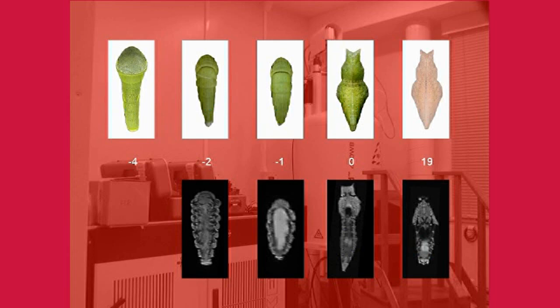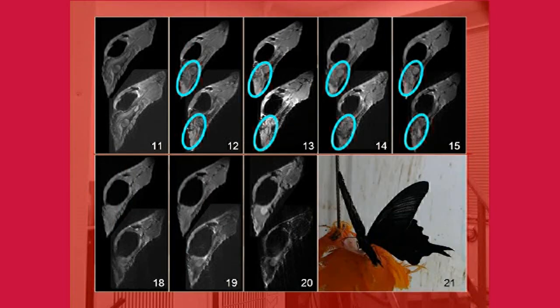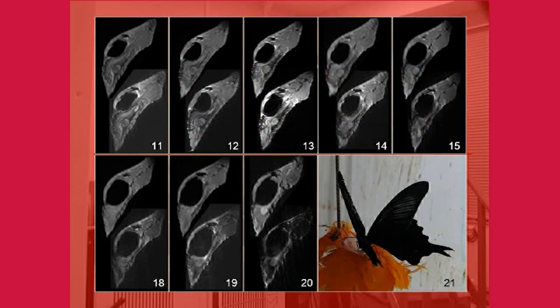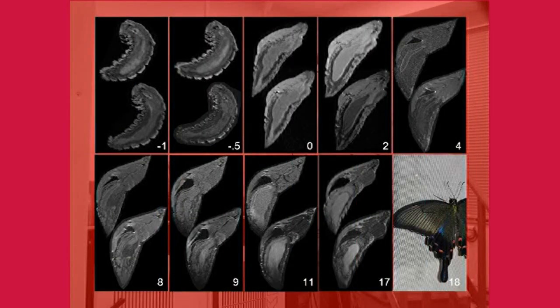After that, the major changes subsided, complex structures gradually began to appear in the lower abdomen, and wrinkle-like structures appeared in the chest a few days before emergence. The day before emergence, the T2 weighted image, which can record the signal of water, is very poor, so it can be seen that the water in the body has moved somewhere at this point. Next, we would like to introduce the changes of the pupae from which female butterflies emerged.